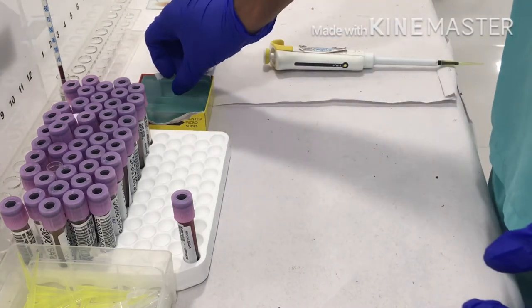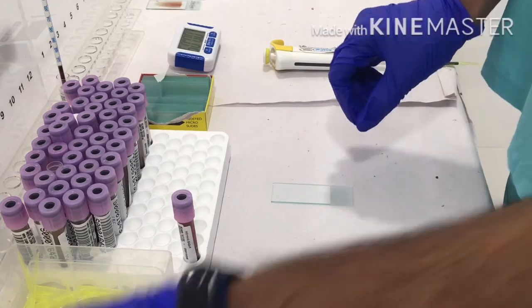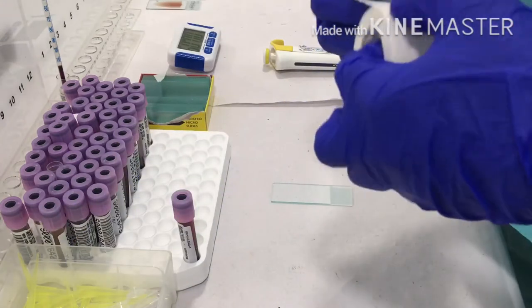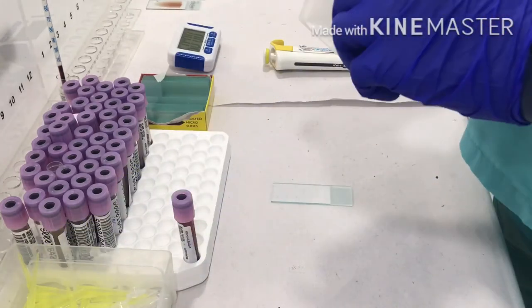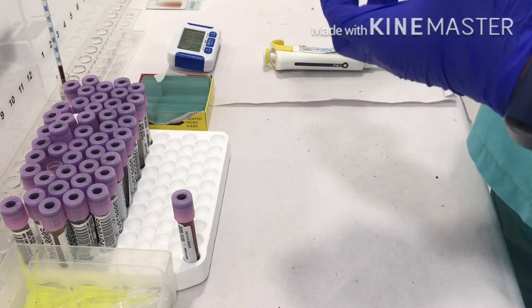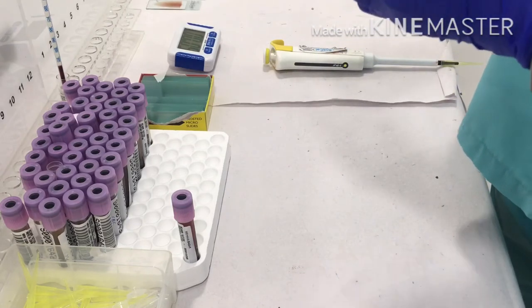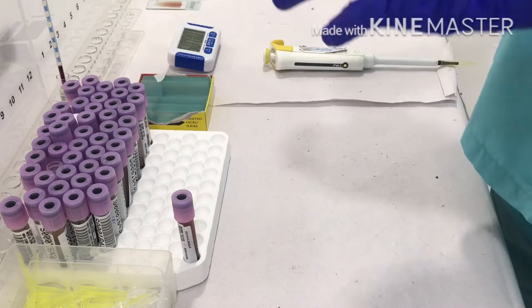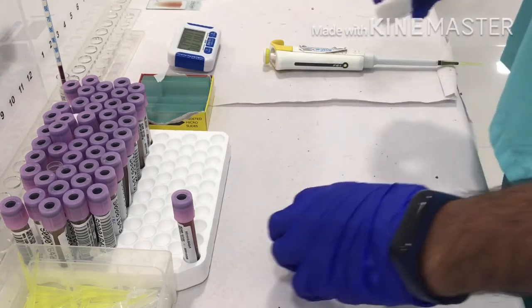So in this one we have eosin and methylene blue stains. We mix these two stains in this one. Methylene blue is the basic dye, whereas eosin is an acid dye. In the beginning I have shown you what this eosin stains and what this methylene blue stains, so you can take a snapshot from there and study from that.